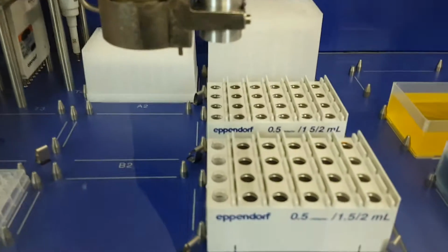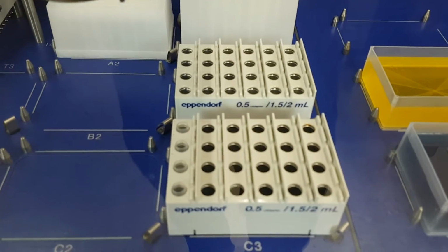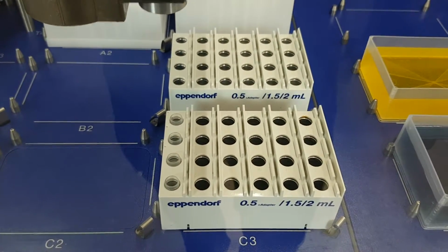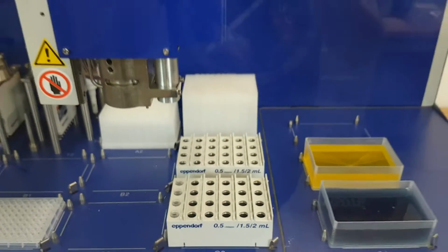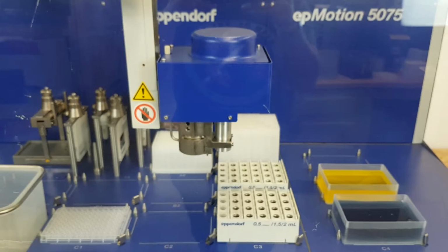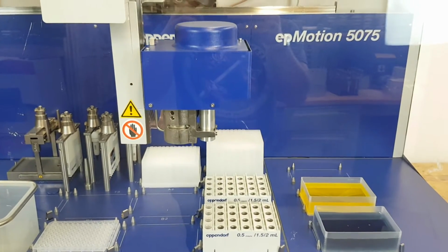And you can see it can read the level inside of these tubes in the thermal block, which is very impressive. It uses an optical sensor to do this.